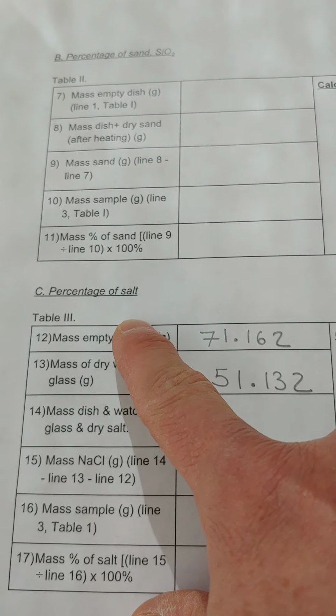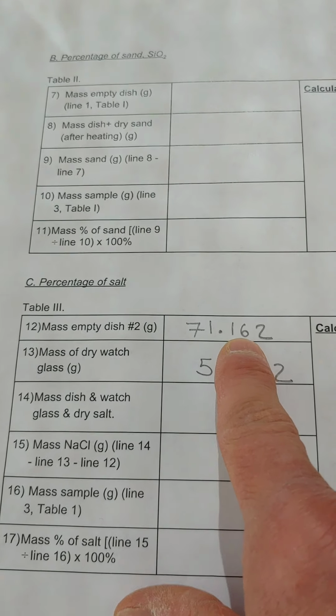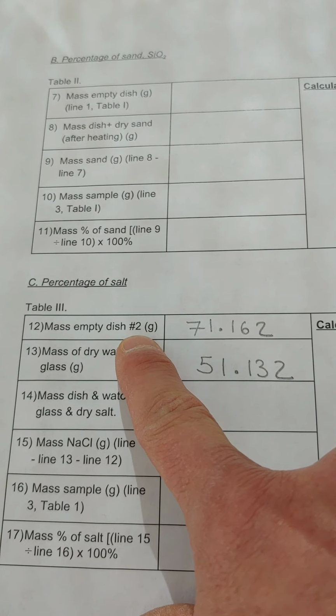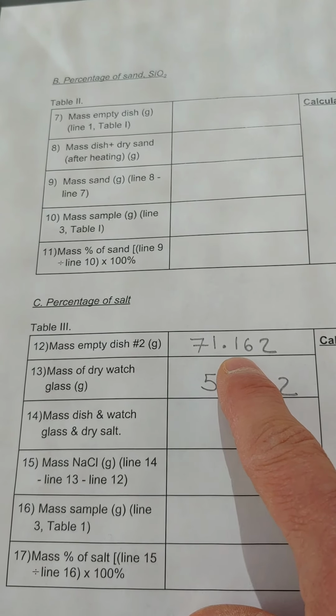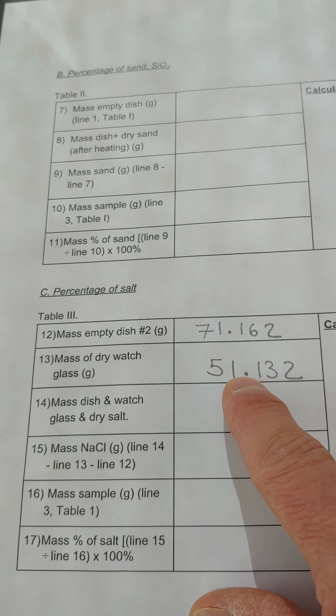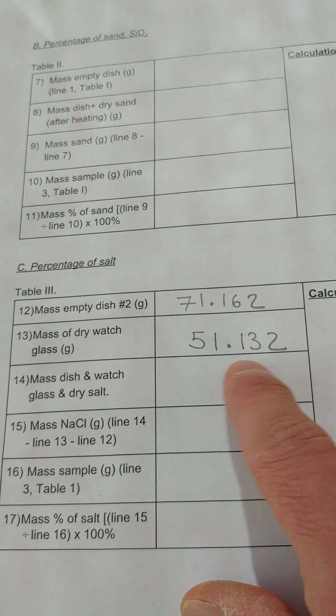So my second dish, if I go here now to part C, table 3, I've written down the mass of the empty dish number 2 and the mass of the dry watch glass. And so that's my empty dish and my dry watch glass. That's going to be the watch glass and the dish that have the salt in it.